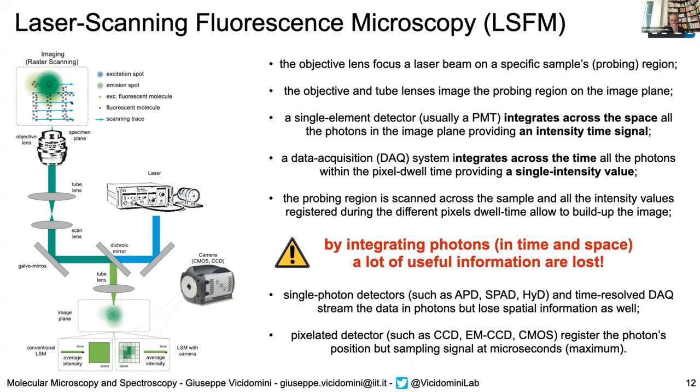So in 2016, it was clear from our side that there was a sort of lack of technology. There does not exist a camera able to also preserve all the temporal information that your sample can potentially provide. So we started collaborating with the Polytechnic of Milan to develop what, in our opinion, was the first detector specifically designed for laser scanning fluorescence microscopy, able to solve the limitations that I explained.